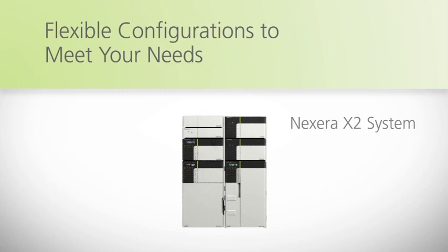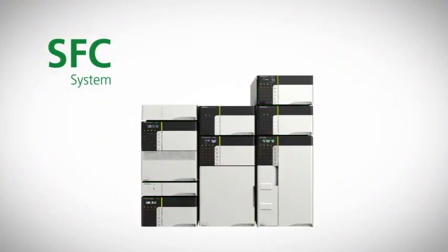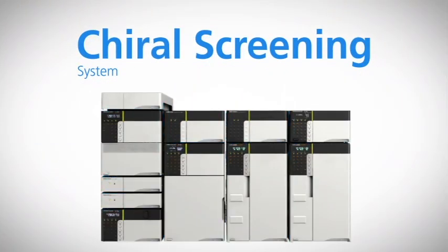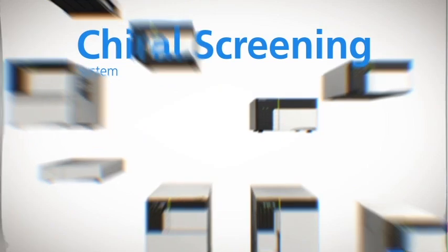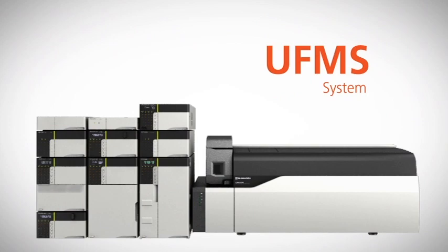Nexera Uc systems can be configured by combining Nexera X2 components and dedicated units based on your analytical needs. You can create an optimal Nexera Uc system, such as a simple supercritical fluid chromatography system, a chiral screening system that assists method development by screening 12 columns and 4 modifiers, or an SFC-MS system with high resolution separation, ultra high speed MRMs, and high sensitivity detection.